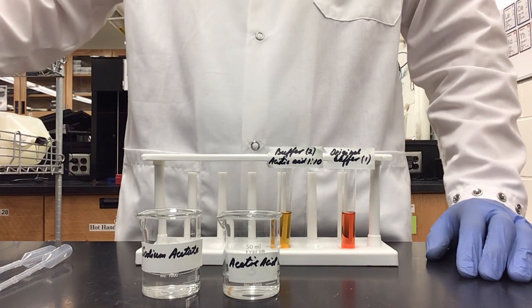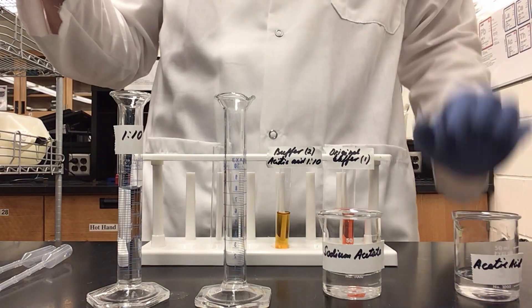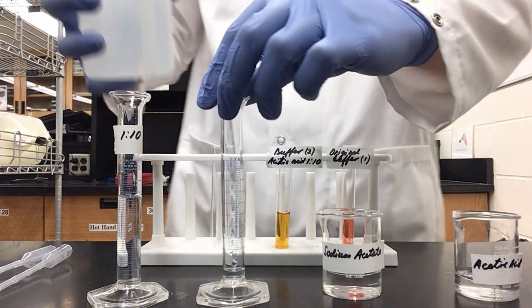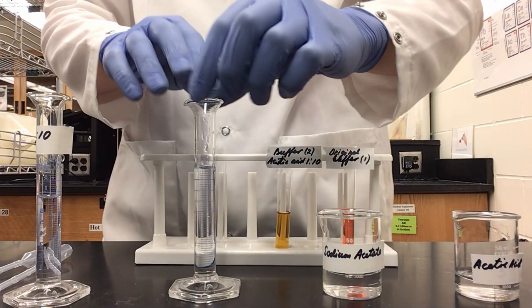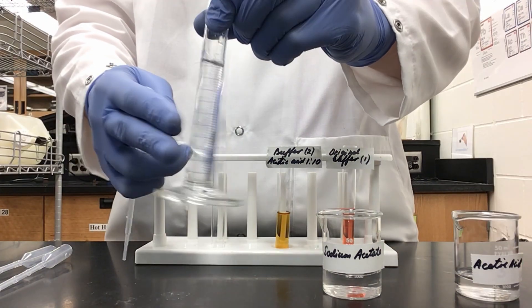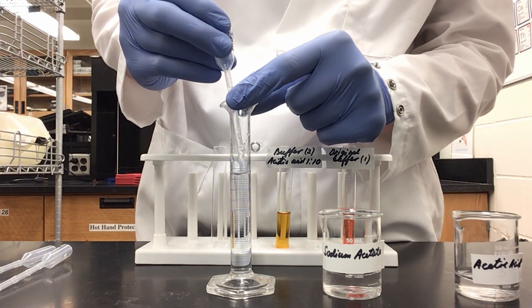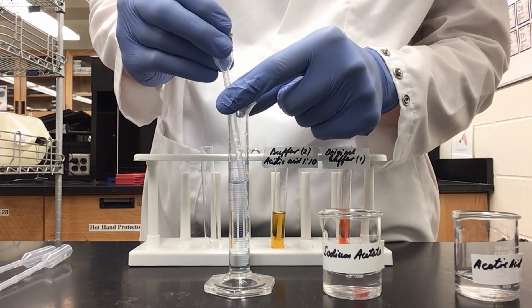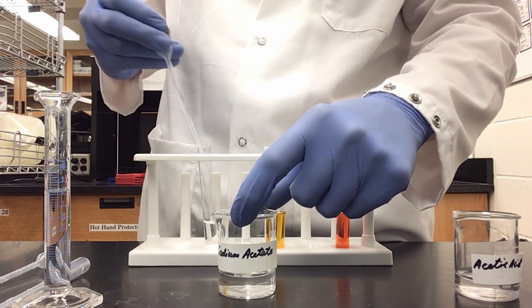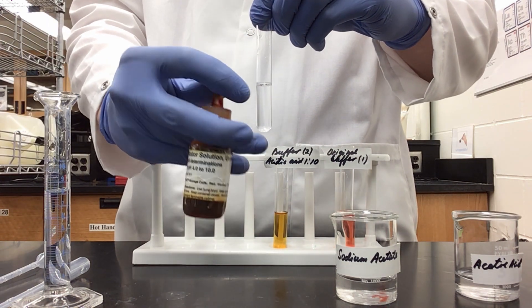Next, I'm going to make a second dilution of my acetic acid. I'll take 1 milliliter of my 1 to 10 dilution and add it to a new graduated cylinder, then dilute up to the 10 milliliter mark with deionized water. This new dilution is a 1 to 100 dilution, since I've diluted it by another factor of 10. I'll tap again to thoroughly mix, then add another 2 milliliters of my extra-diluted acetic acid and 2 milliliters of my sodium acetate.